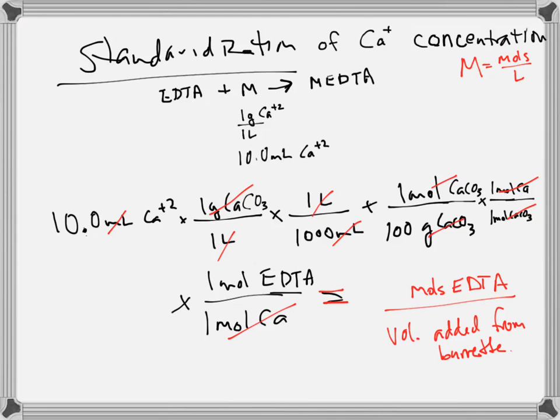Cool, so what do we have? We have the concentration of EDTA from one trial. What happens if you screwed up that trial? Your standardization number is wrong. So what should you do to fix that? Do it again. What happens if both those trials are wrong? You'd have to do it again. So what we're going to try and do is minimize the experimental error by repeating the standardization attempt multiple times. Okay? At least 3 times. Okay? In theory, you should be checking your molarity calculation at the end of each trial and verifying that it's pretty close to the other one.